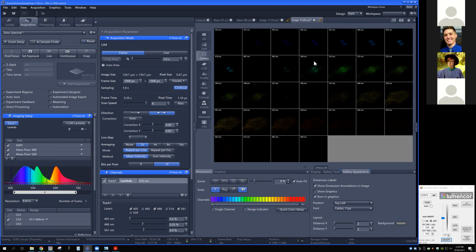But what I really want to show you is the range of distribution of each one of these different fluorophores. So your DAPI basically starts around here, around 425. And you can see it basically extending here. You can see that it drops here, and I'll talk about that in a minute. But it really does extend, honestly, out into these more yellowish ones right here. This is exactly the reason why I was running into problems with some crosstalk between this and my red channel.